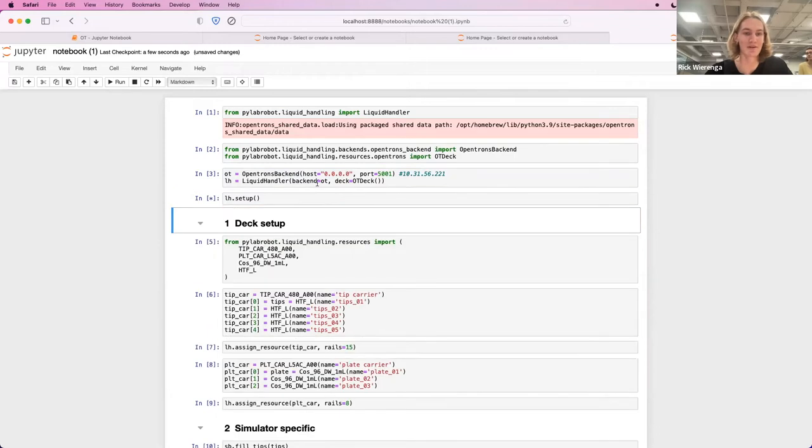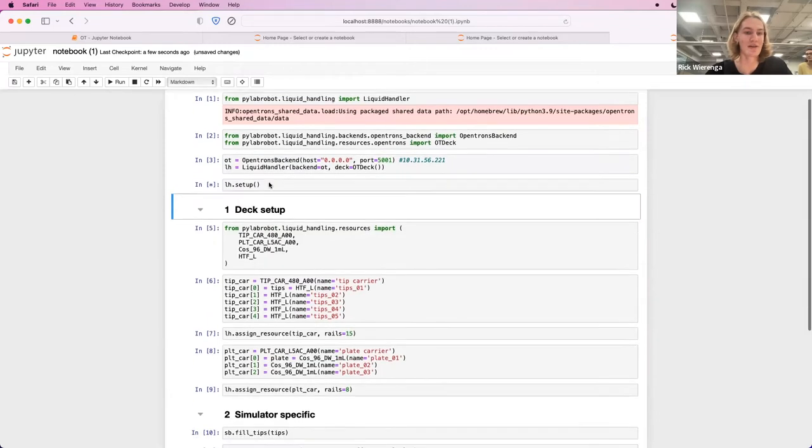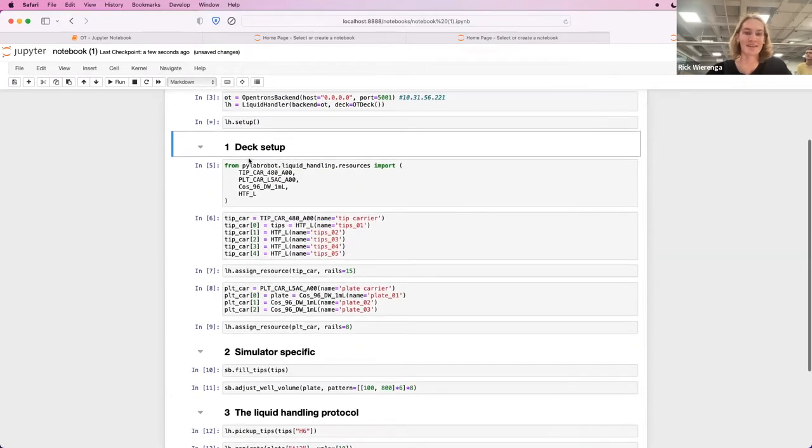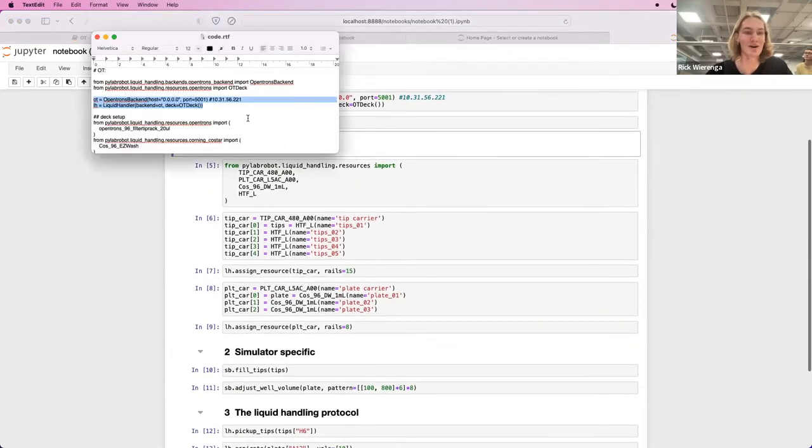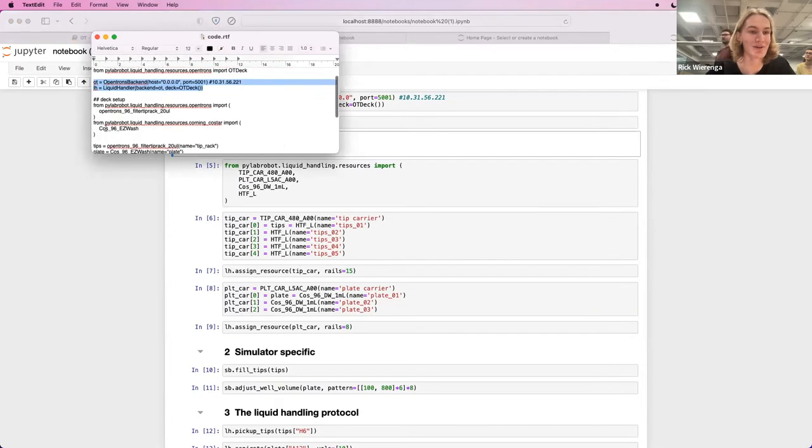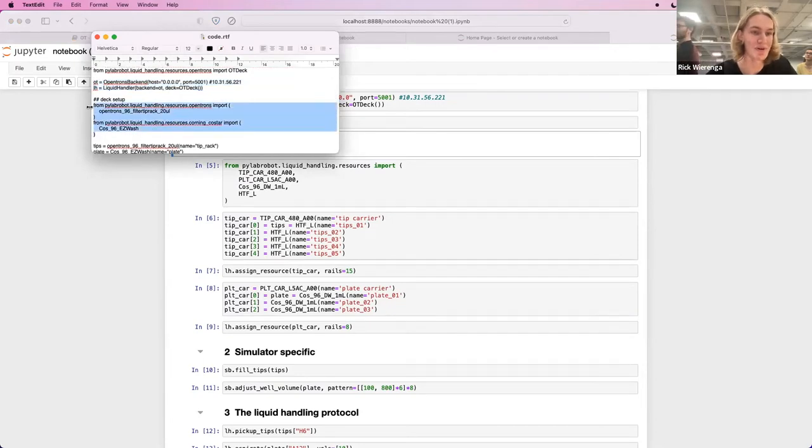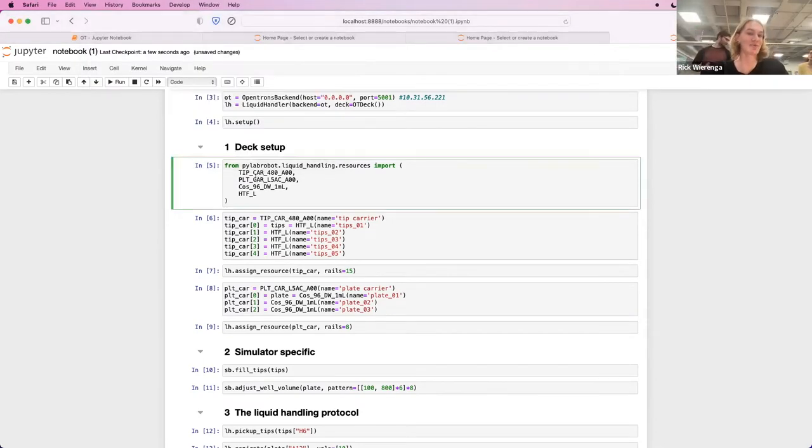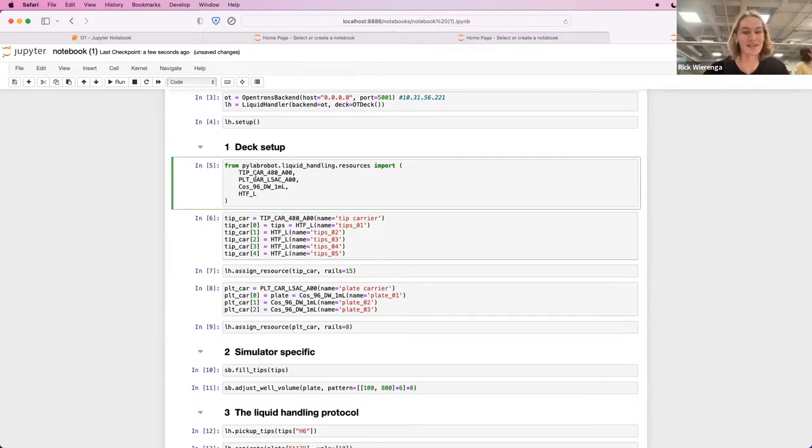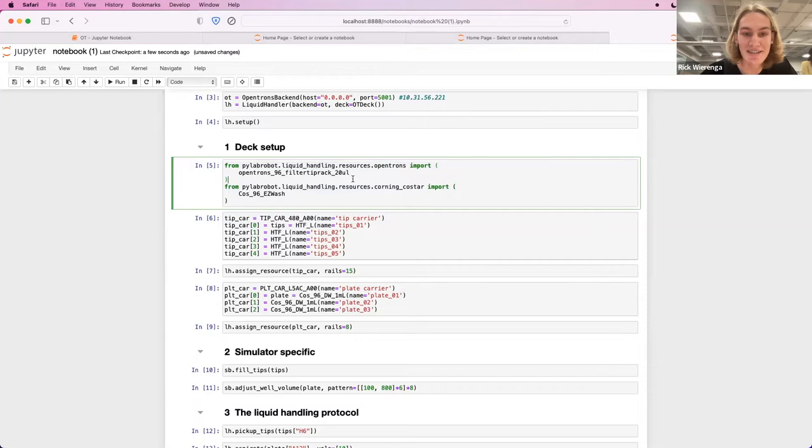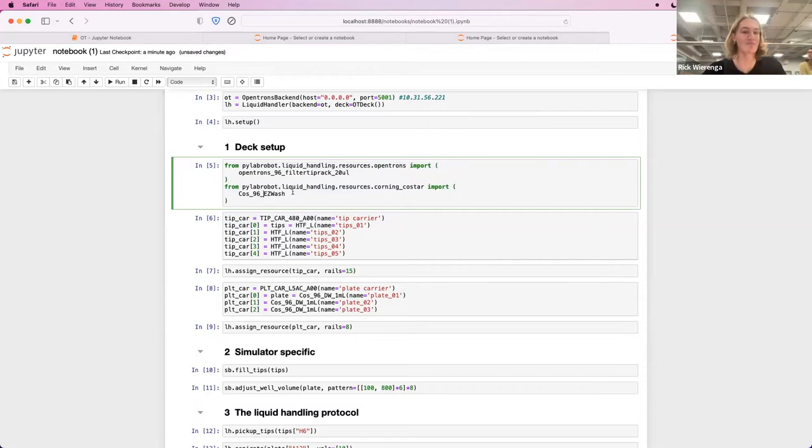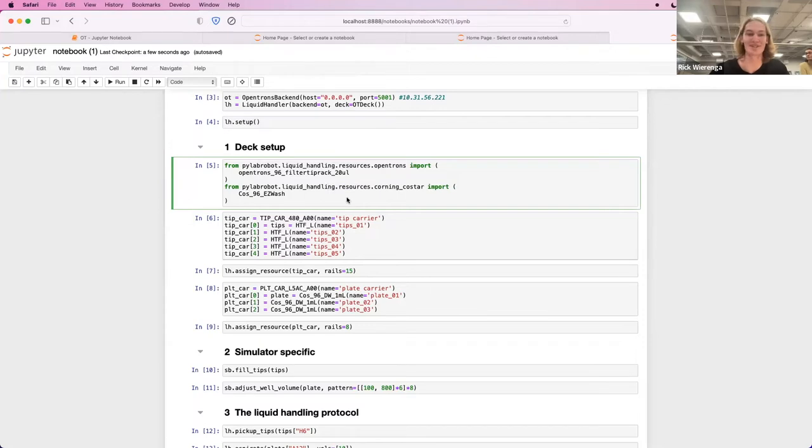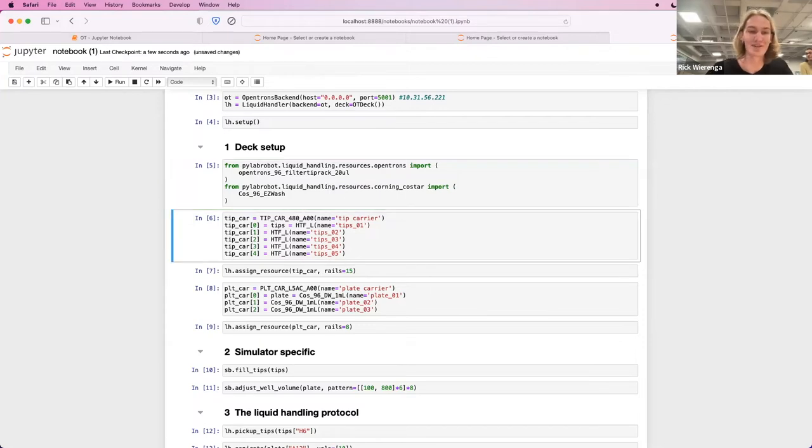I'm gonna call setup, which takes a little while. We can move on to deck setup. We have to import a little bit different resources because we use a different layout on this deck. Now you can see that we import the Corning CoStar plate here, which typically is a Hamilton plate, but it can also work with the OpenTrons. And this resource is defined as a Venus resource, which is really cool.